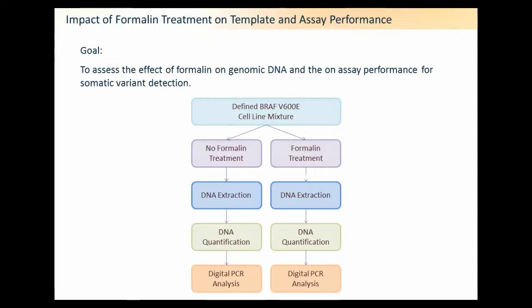Looking at DNA samples from a diagnostic lab, we can observe quite a lot of variability between samples. This variability at least partially originates from different formalin intensity levels, leading to differences in many aspects, for instance, fragmentation levels, the amplifiability of the DNA, as well as chemical modifications such as deamination and cross-linking. These characteristics can have a profound impact, as Jonathan mentioned, on clinical diagnostics and can lead to assay failure.